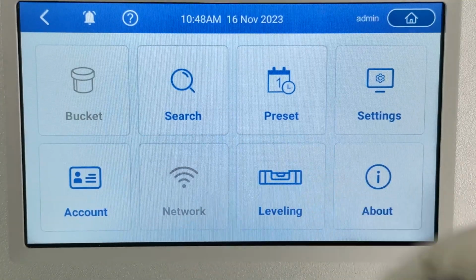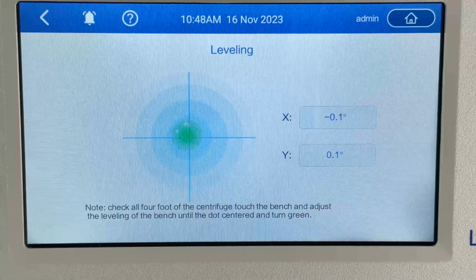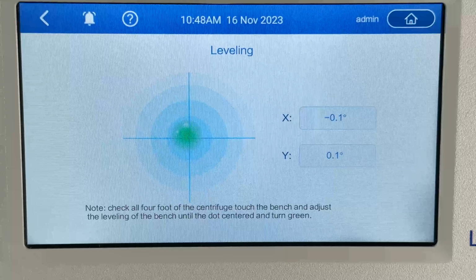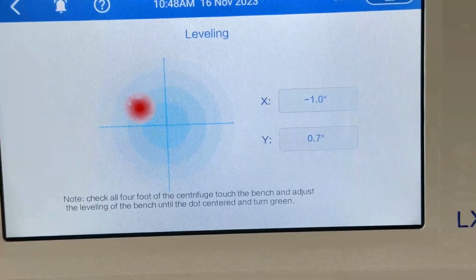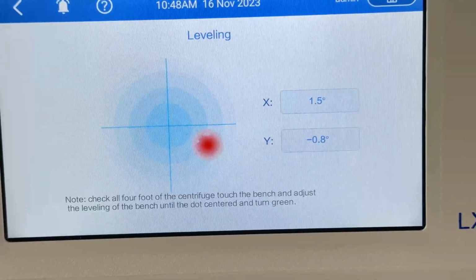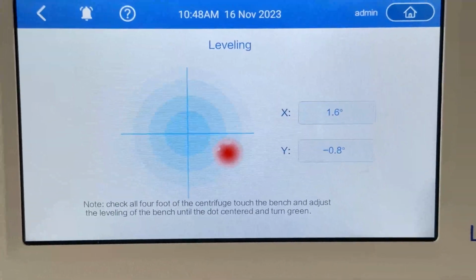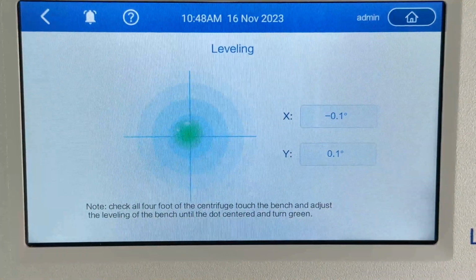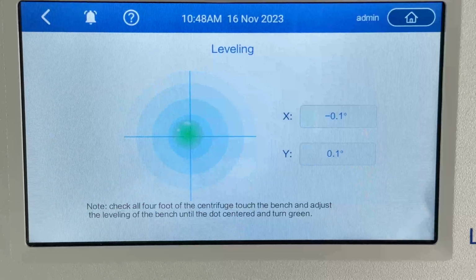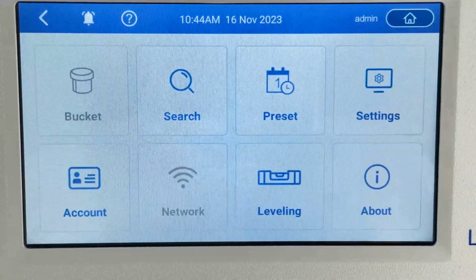The machine also has a leveling system, and here it shows that it's at a safe level. It's got a sensor in to test that, and if I were to come up and just move the angle of the unit, it quickly shows that it is no longer safe to be run. So red shows you it's not safe. I think in most labs you can have pretty straight cabinetry, but if you are in an older lab, it's worth checking.